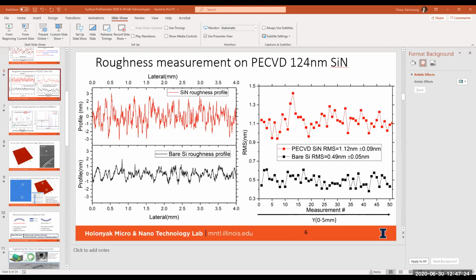I mean, again, I guess I don't know what is the source of the surface roughness for the silicon surface. So is that your expectation that that is the smoothness of the silicon itself?